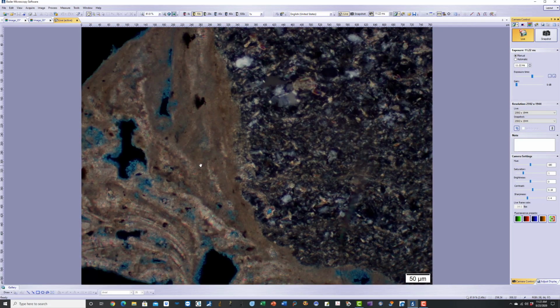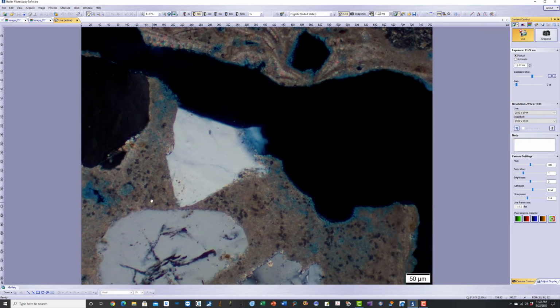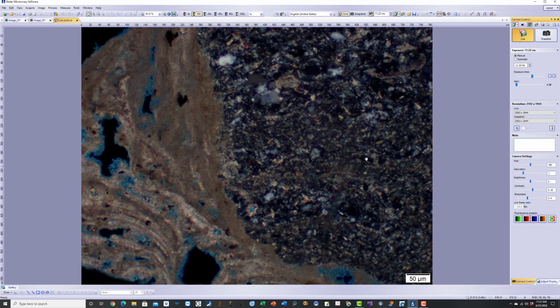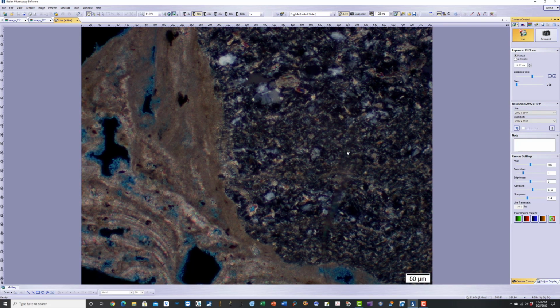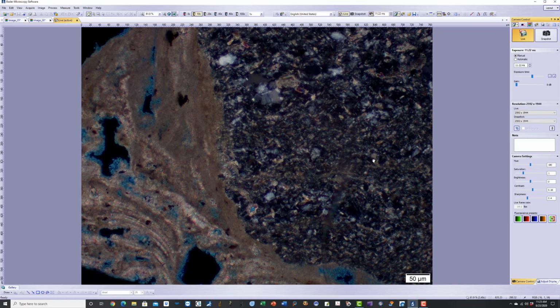And here is the efflorescence deposit, layer by layer precipitation of secondary calcite. This is the quartz grain with calcite precipitate, where the calcite came both from the cement hydration product, and part of the calcite also came from the calcite in the slate matrix. In cold weather, when cold water enters the slate, it will dissolve calcite more efficiently than warmer water. Calcite has a reverse solubility.